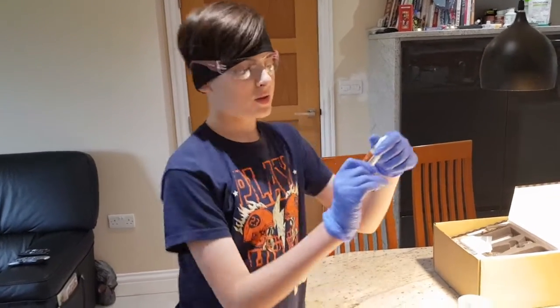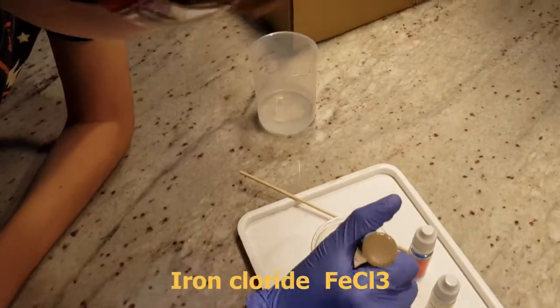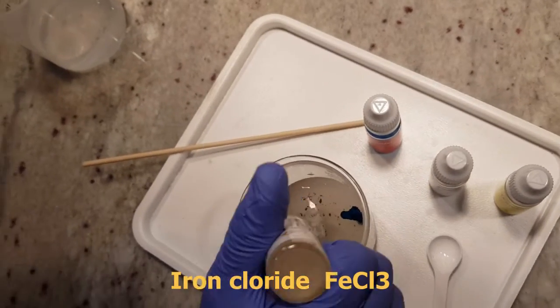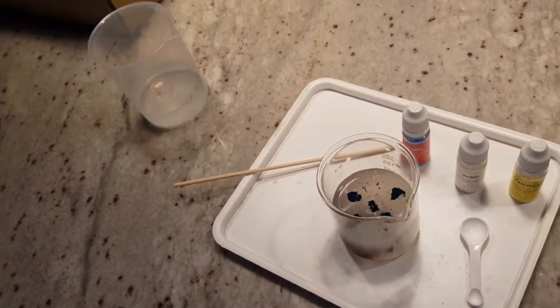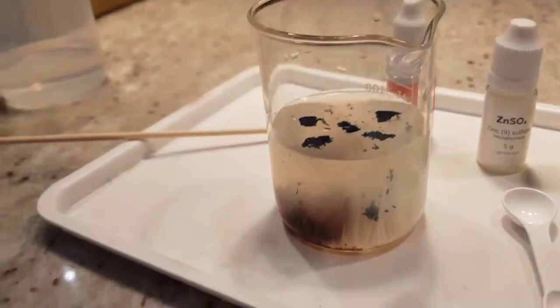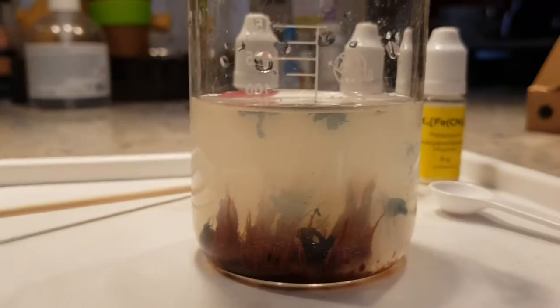A similar reaction can happen between liquids. I'm going to be using iron chloride. 1 drop, 2 drop, 3 drop, 4 drop, 5 drop. Now this should create more little tentacles.